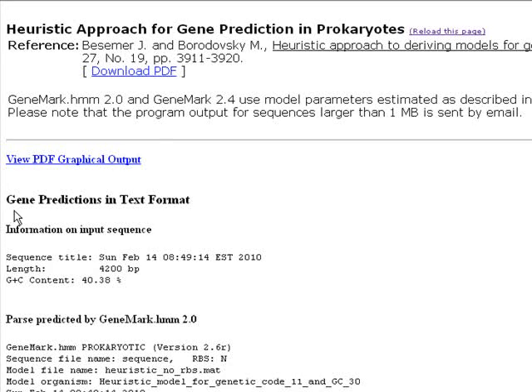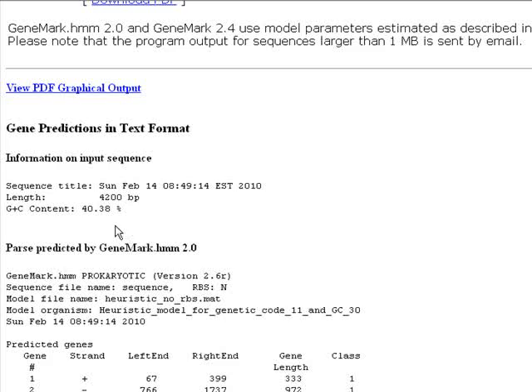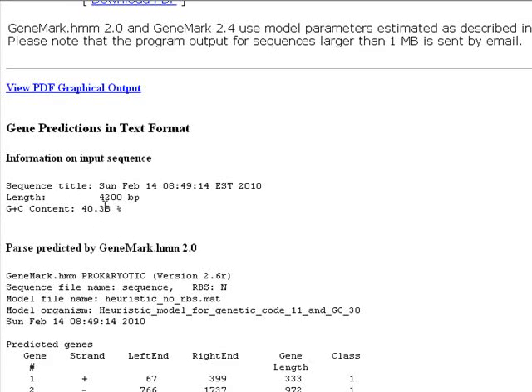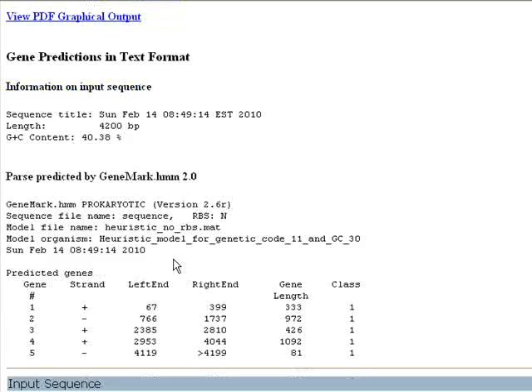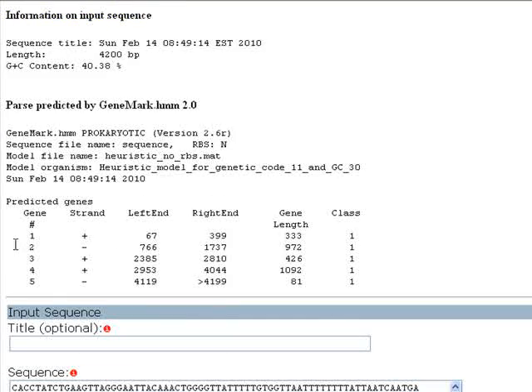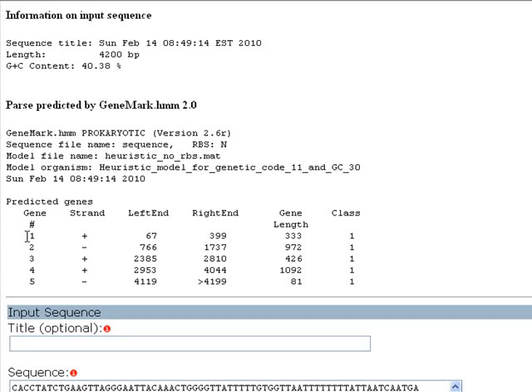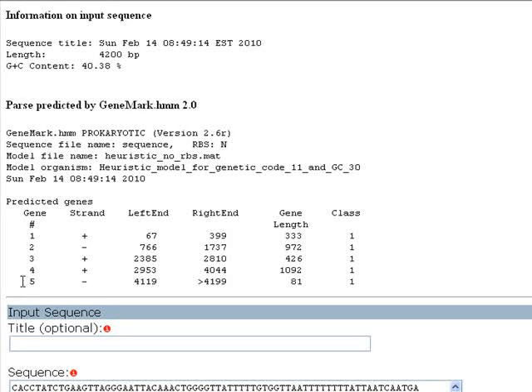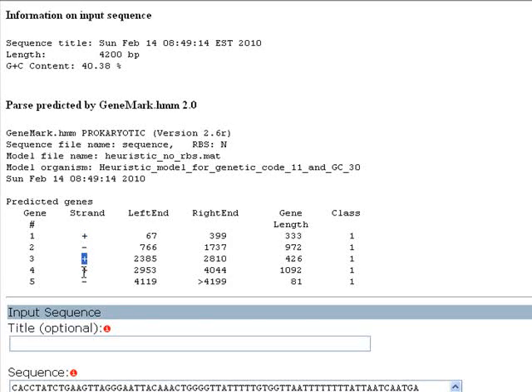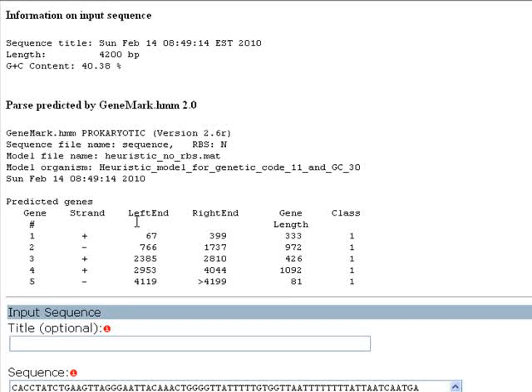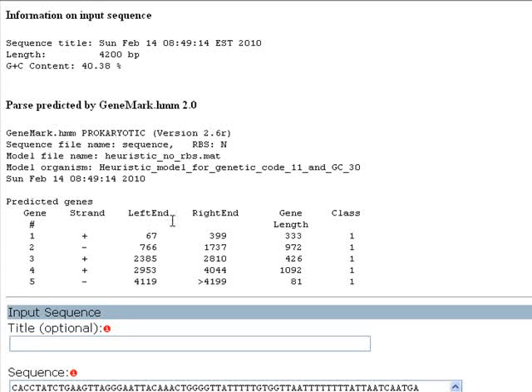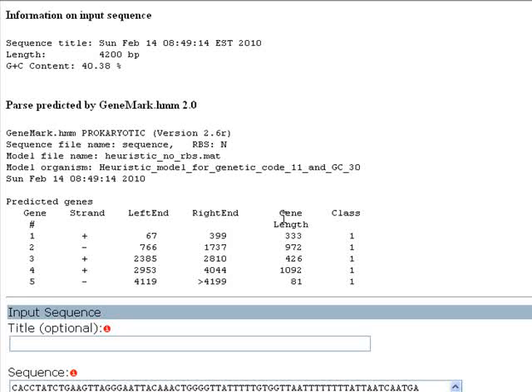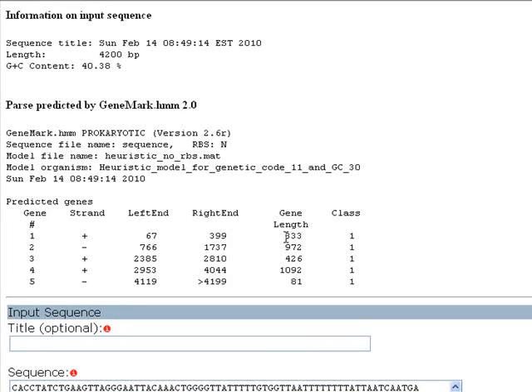And here is our text format. We have the length of our sequence here. We have the percent of G plus C. And these are our predicted genes. There are five predicted genes. Three on the positive strand and two on the negative strand. Here is the left end or the start codon, and here is the right end or the stop codon. Here is our gene length and here is the class.